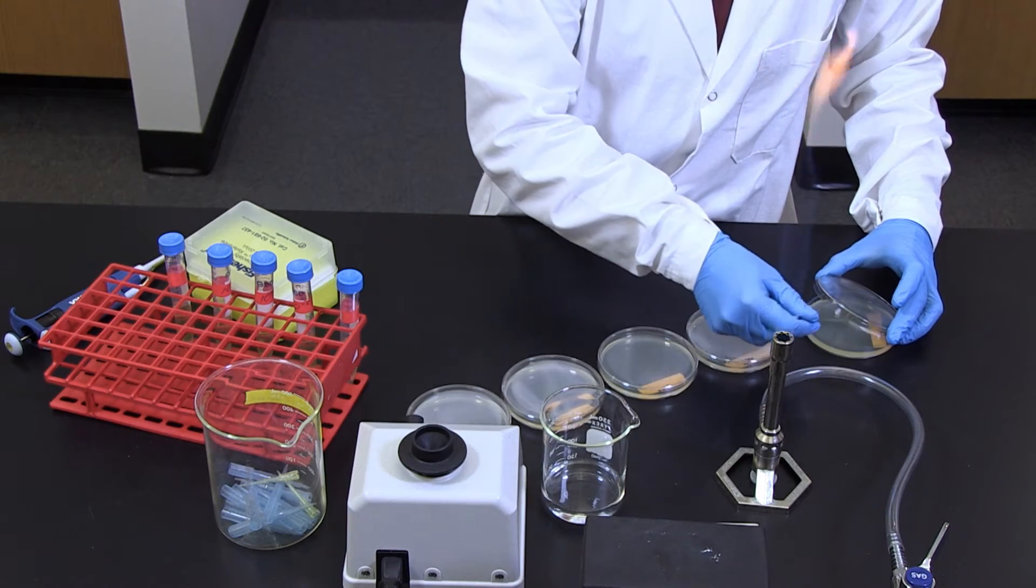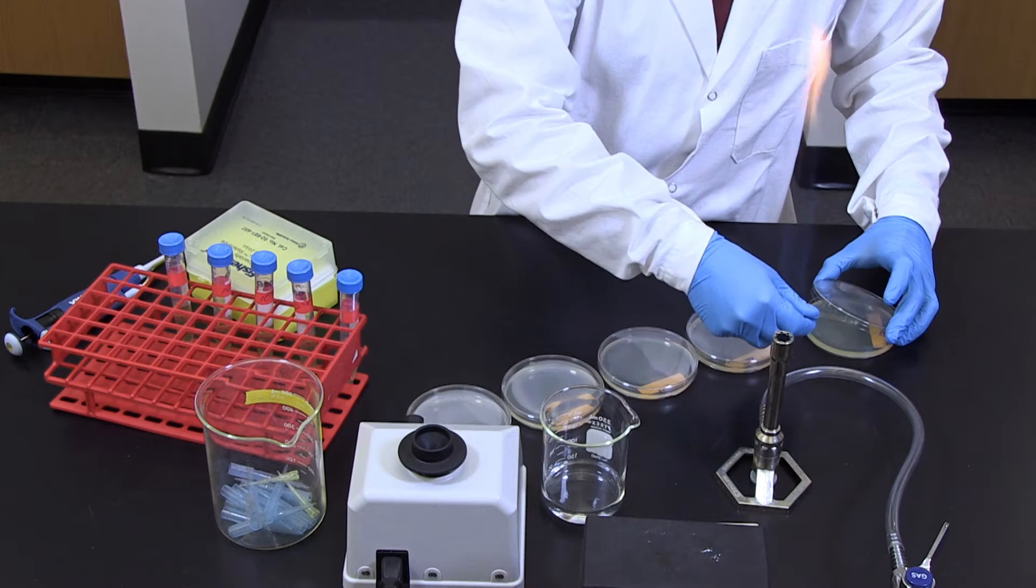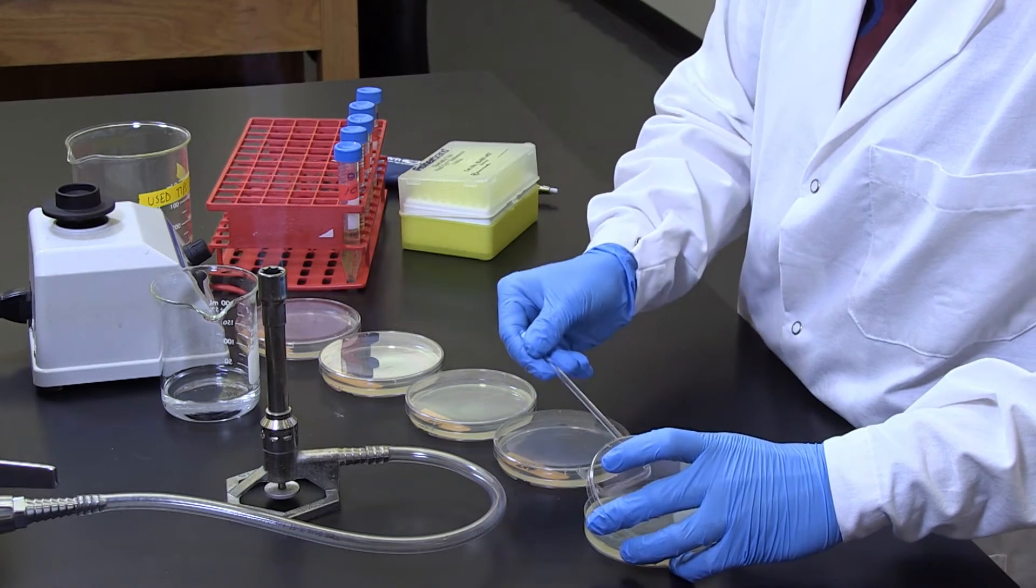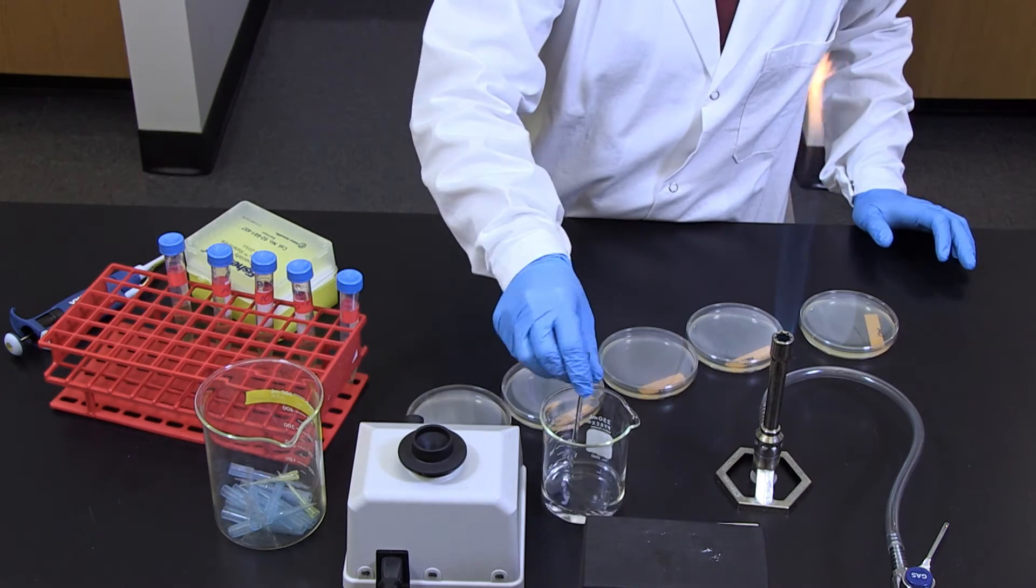The diluted samples from ten negative one to ten negative three are highly concentrated, which will produce confluent growth on the plates. Therefore, they should not be used.